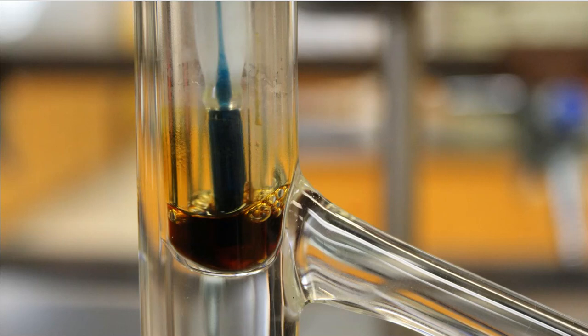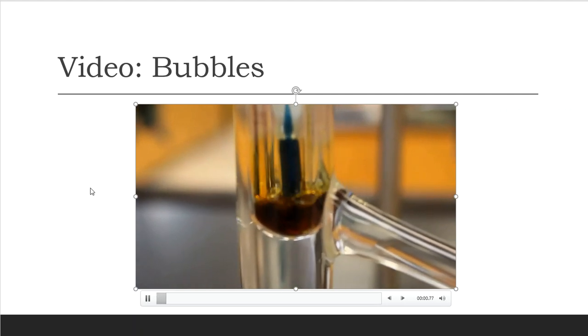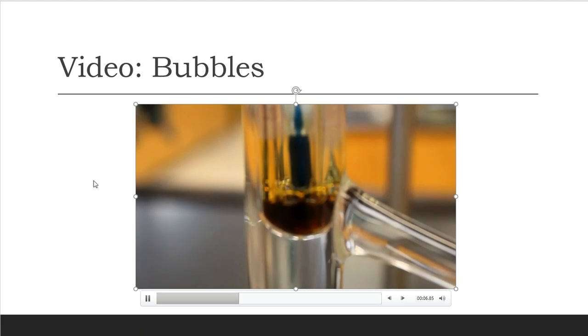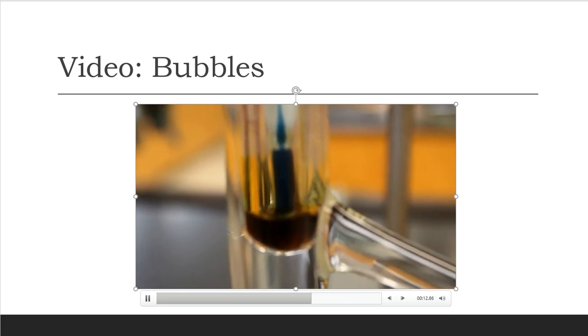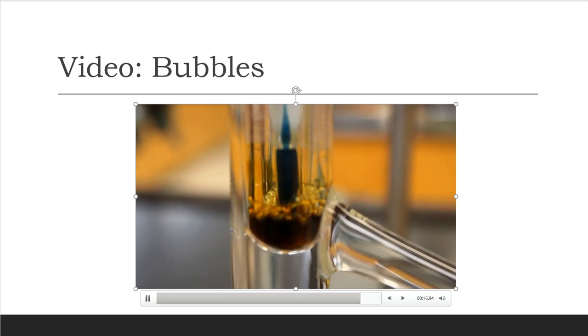So I created a video for you so that you can see the bubbles that are getting ready to happen. Guys, my solution's starting to bubble, as you can see. I'm going to take the heat away from it at this point, and when I see the bubbles stop, I'm going to read the thermometer. And that's going to be my boiling point for this hexanol that I have in the test tube.